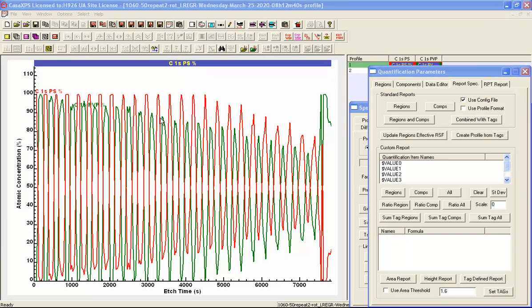When I referred to the linear least squares approach to generating a depth profile as being basic, it's because the fitting only allows for variation in intensity. It does not allow for shifts, and it does not allow for broadening of peaks. And it is for this reason that we generally use nonlinear least squares to analyze data such as these.